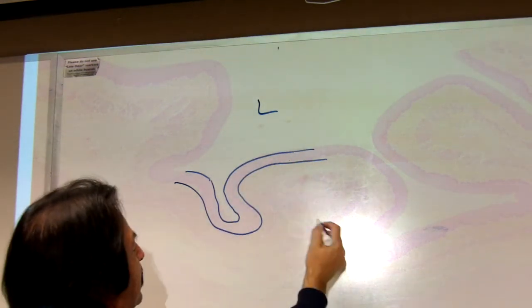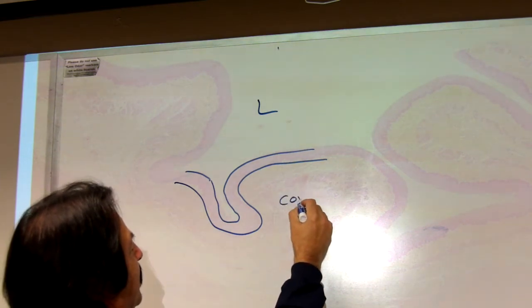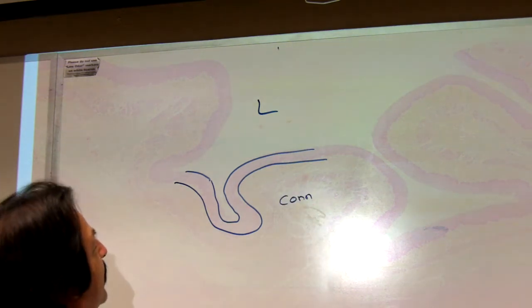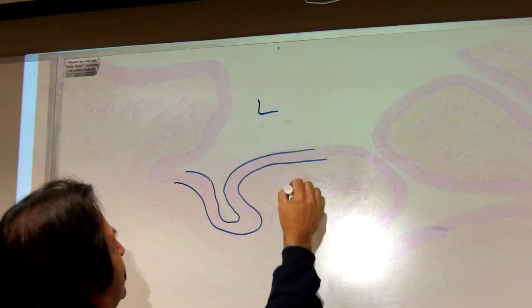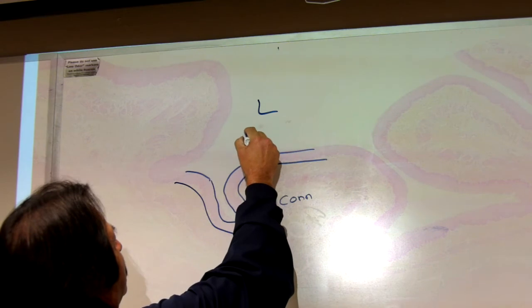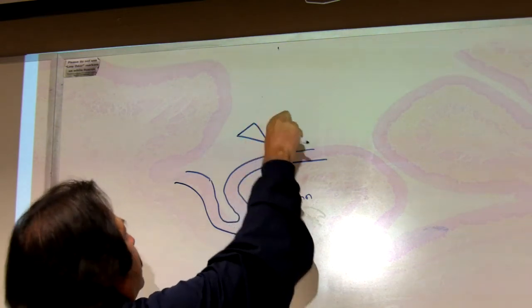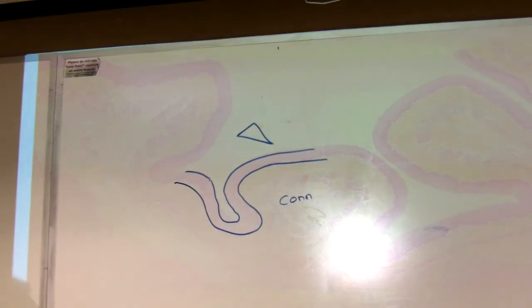So this is our epithelium. What's all this tissue right here? That's right, this is all connective tissue. Okay? Epithelium, okay, basal, apical, and what's that right there? Yeah, that's a Dorito right there. Okay, that Dorito's right there.